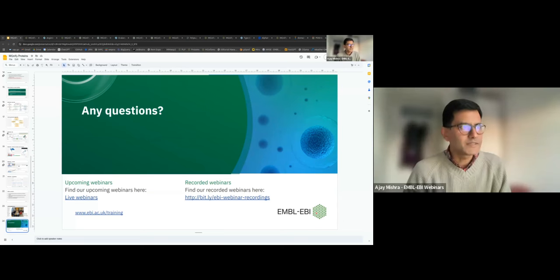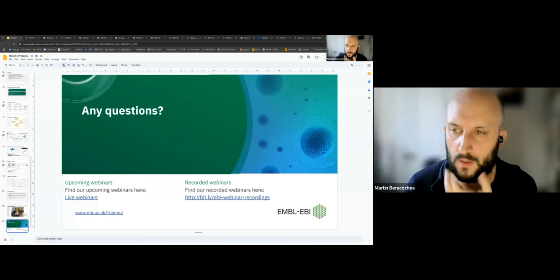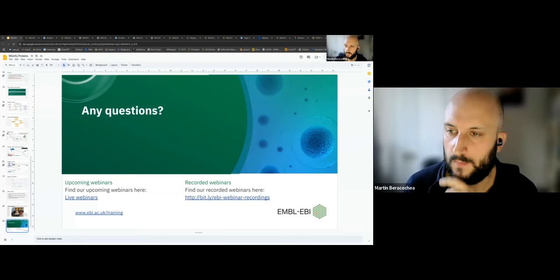Okay, great. Thank you. Can one provide a profile HMM already made locally instead of single sequence to search the MGnify protein database? I think that can be done, but not through this site. It can definitely be done through the API, but not through the MGnify protein site. No, but you can use the sequence search. You just posted the answer there. You can use the sequence search and upload.